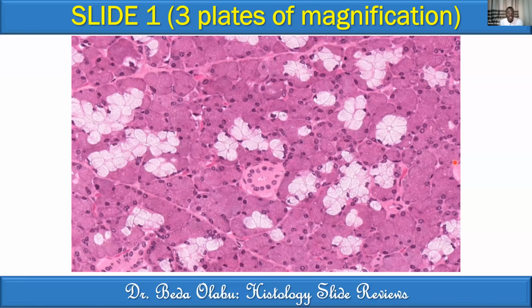So in this second level of magnification, I just want you to add to the first list of things you've written down. Just capture what is new, so that you don't have to repeat what you've written. But if something comes into better view, you can highlight that, or what is new, you can highlight that.